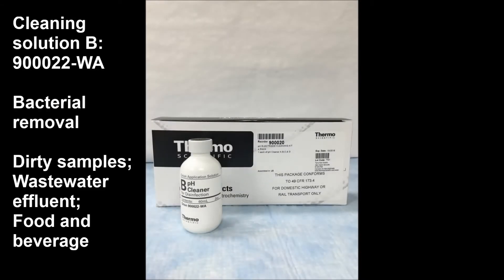Cleaning solution B is intended for bacterial removal. This is for use with samples such as dirty samples, wastewater effluents, food and beverage, or anywhere where bacterial growth could be an issue.